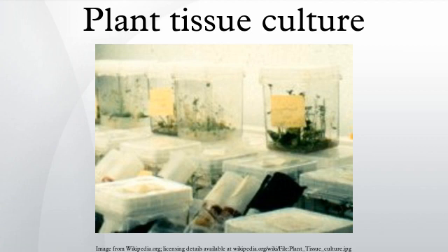Aerial explants are also rich in undesirable microflora. However, they are more easily removed from the explant by gentle rinsing, and the remainder usually can be killed by surface sterilization. Most of the surface microflora do not form tight associations with the plant tissue. Such associations can usually be found by visual inspection as a mosaic, decolorization or localized necrosis on the surface of the explant.